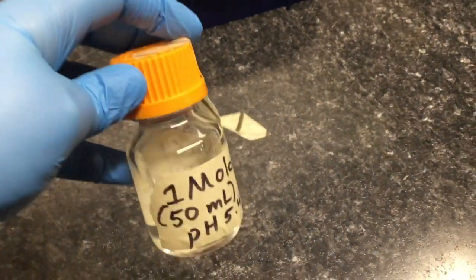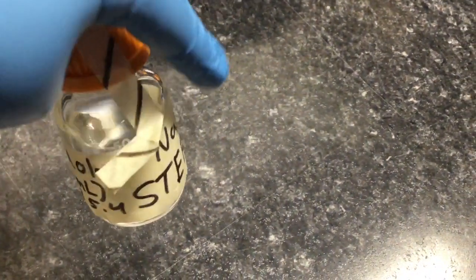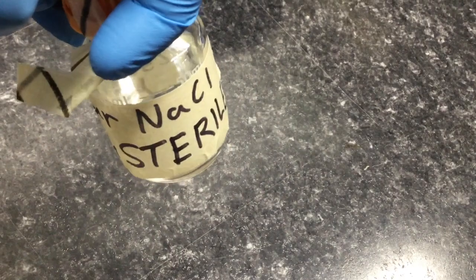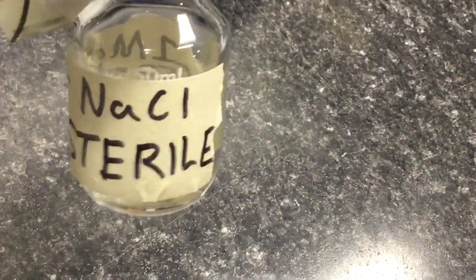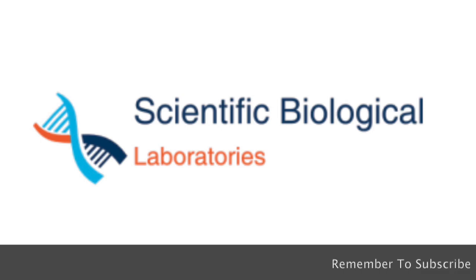After sterilizing, I will place the solution into a sterile 50 milliliter bottle and label appropriately.